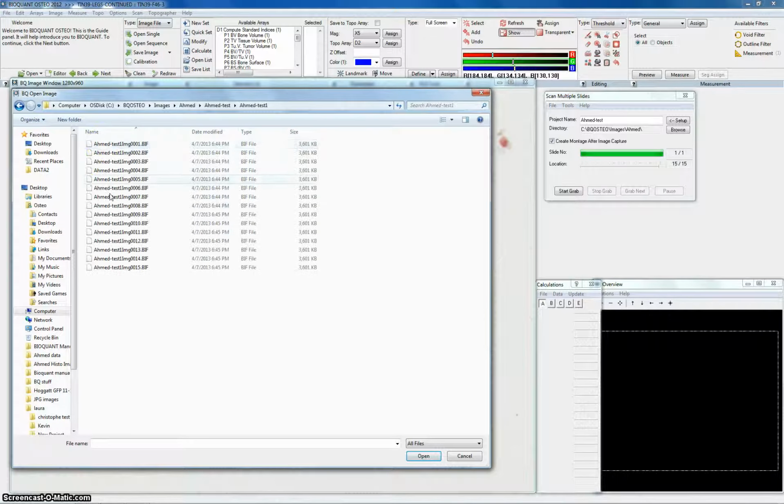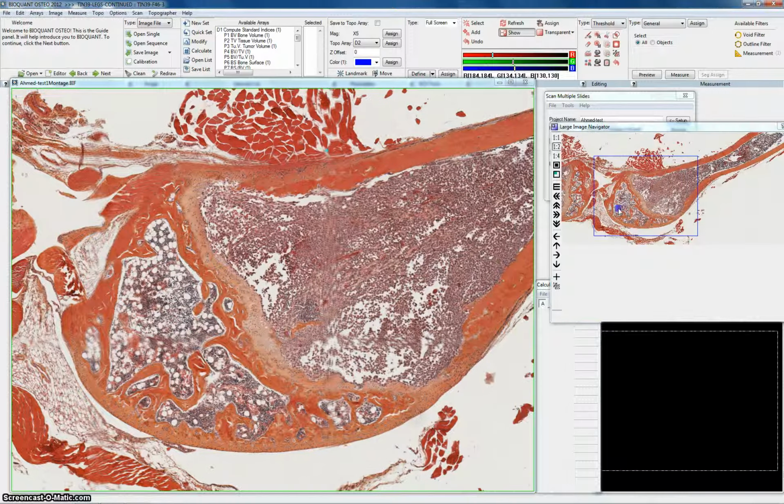Okay, what we have here is the topography for the whole image, and this is the 1:1, which is every frame. So this is the 5x magnification, multiplied of course by the other lens, but this is the whole one. You can make it 1:2, so this is a bigger view. See, this is the stitching line between two frames. It's kind of hazy. We're working on that for now. Or you can hit this button here to get the exact same view. See this clean, nice distal femur?